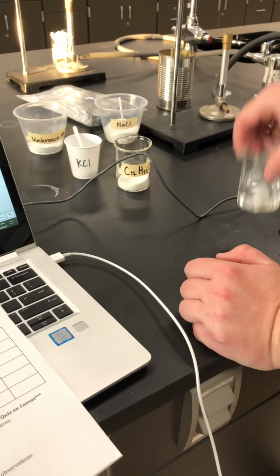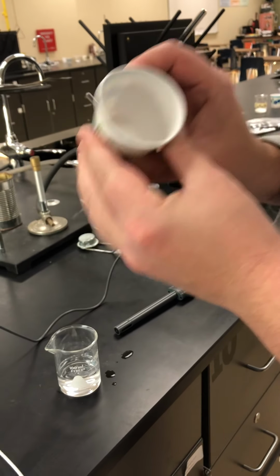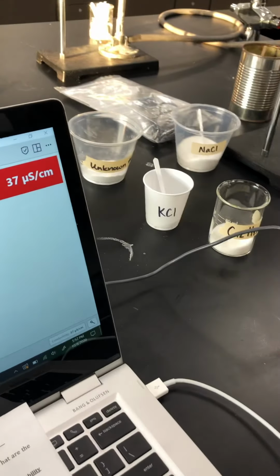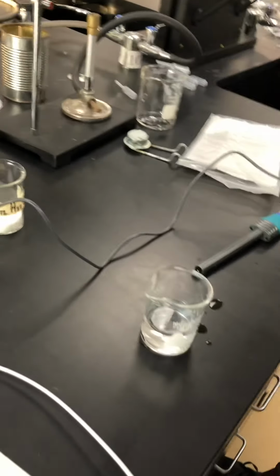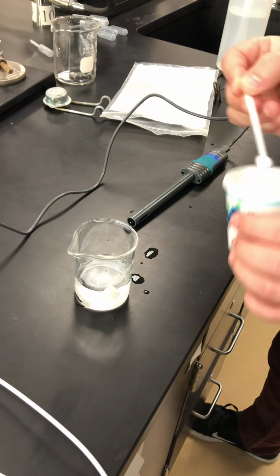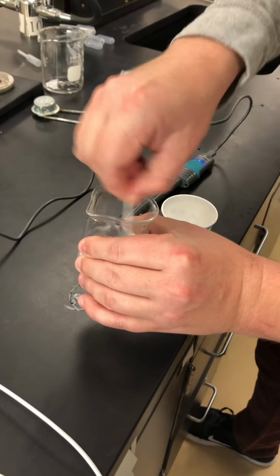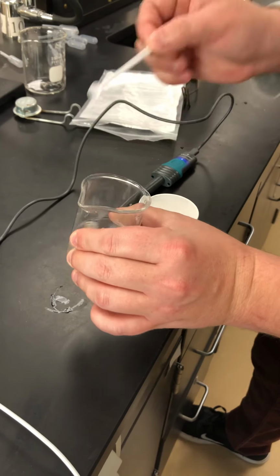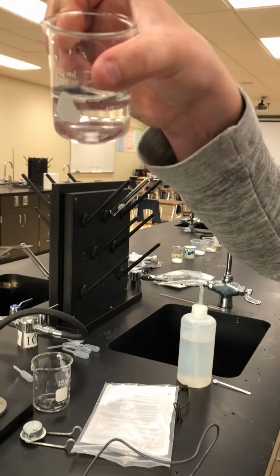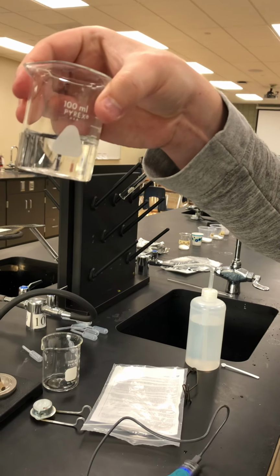And then the last one we're going to test is unknown 2. And unknown 2 is also a white solid. And we will do 2 scoops of that. Stir it up. A little more. Again, a little bit at the bottom, but I could probably stir it more if I wanted to.